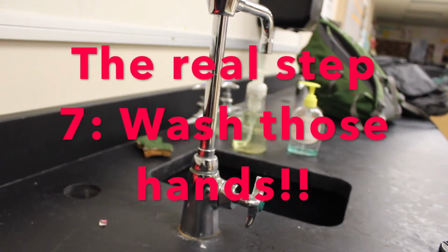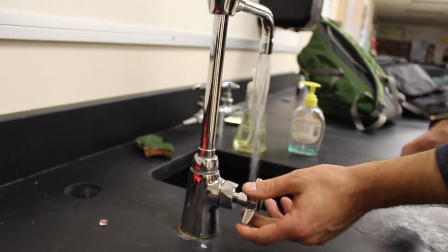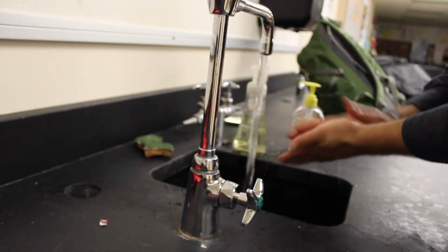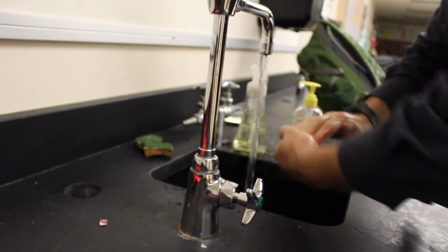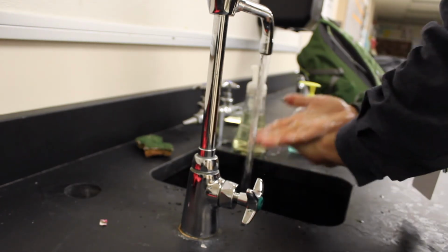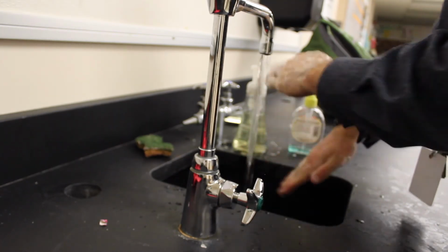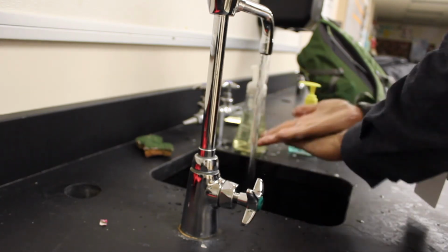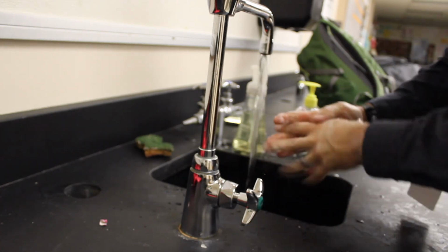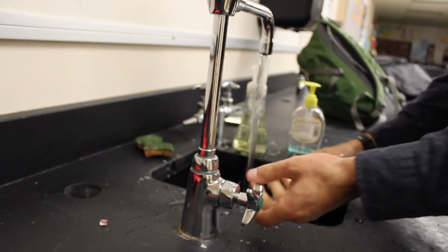The final step, and most important, we gotta wash those hands. So first, you're gonna put water, then add soap. Get all those cracks. Rinse and dry. And you're done.